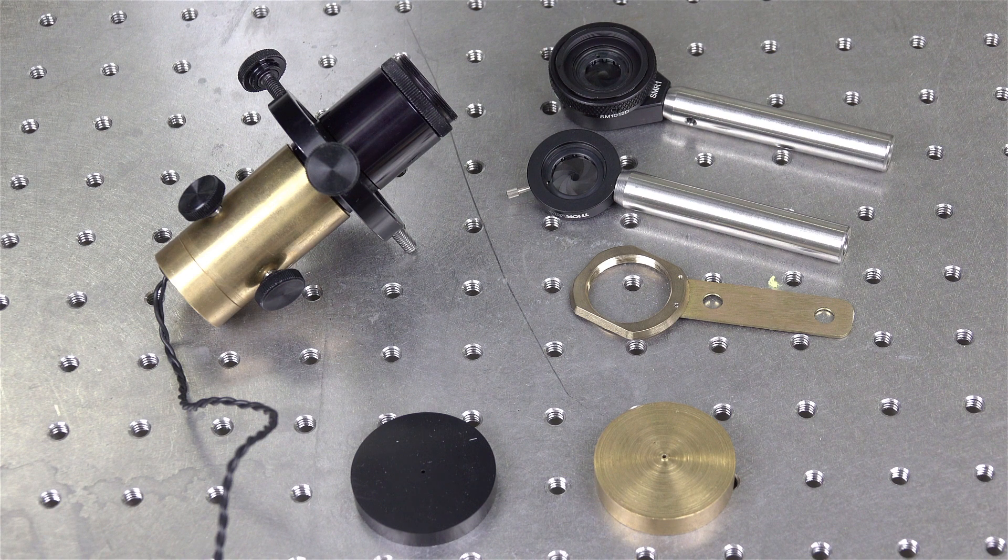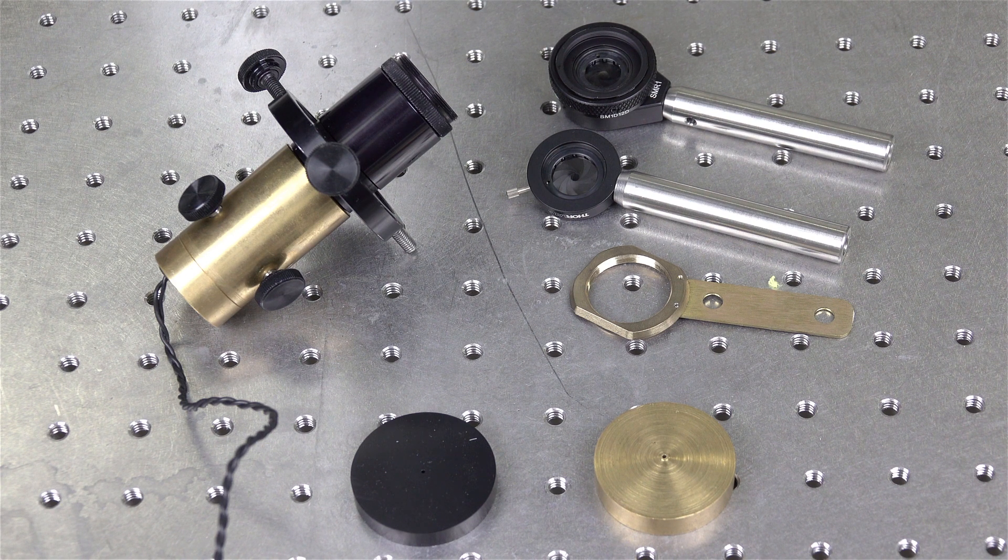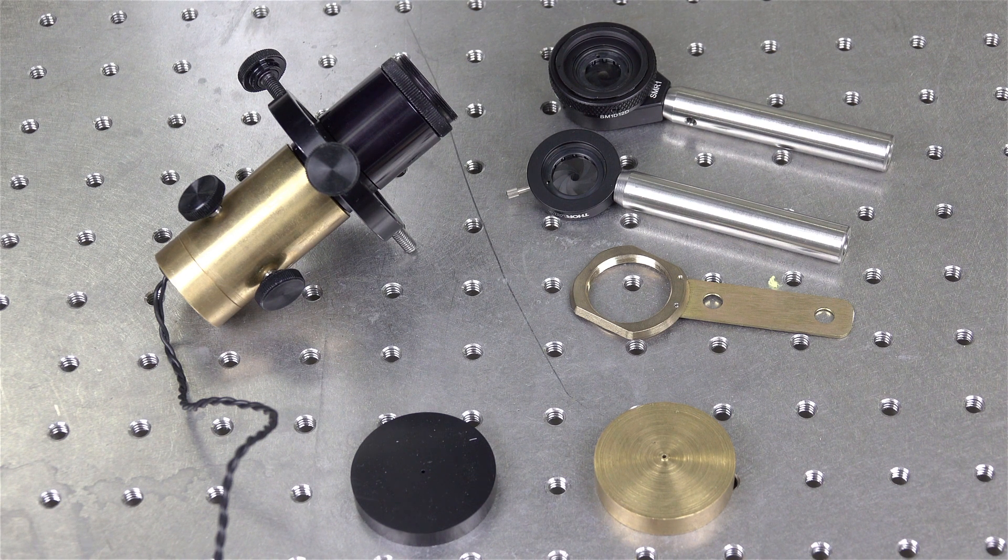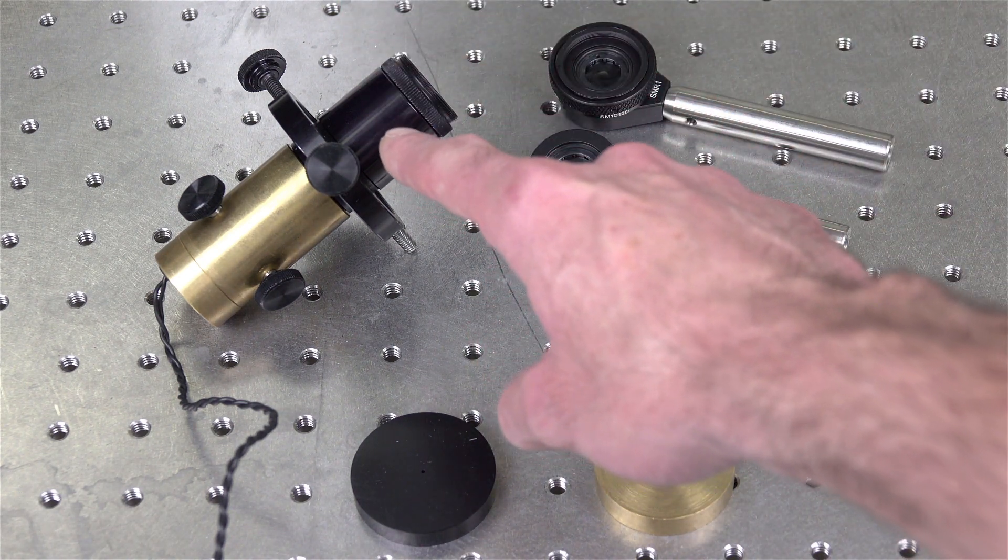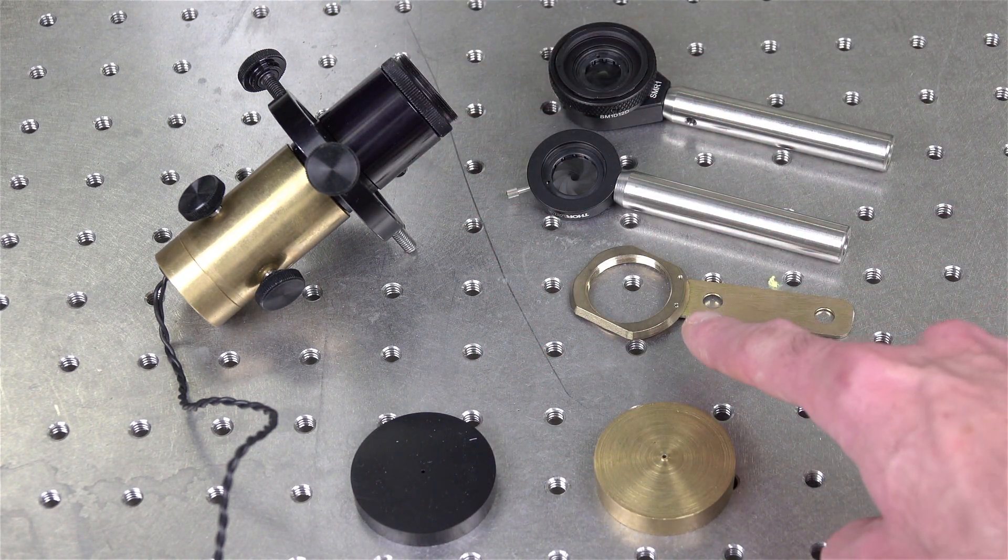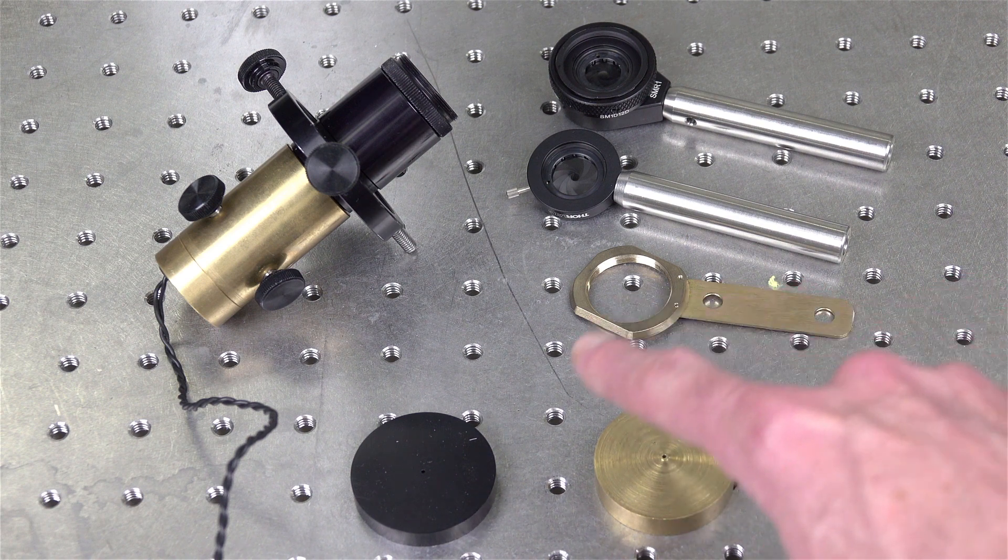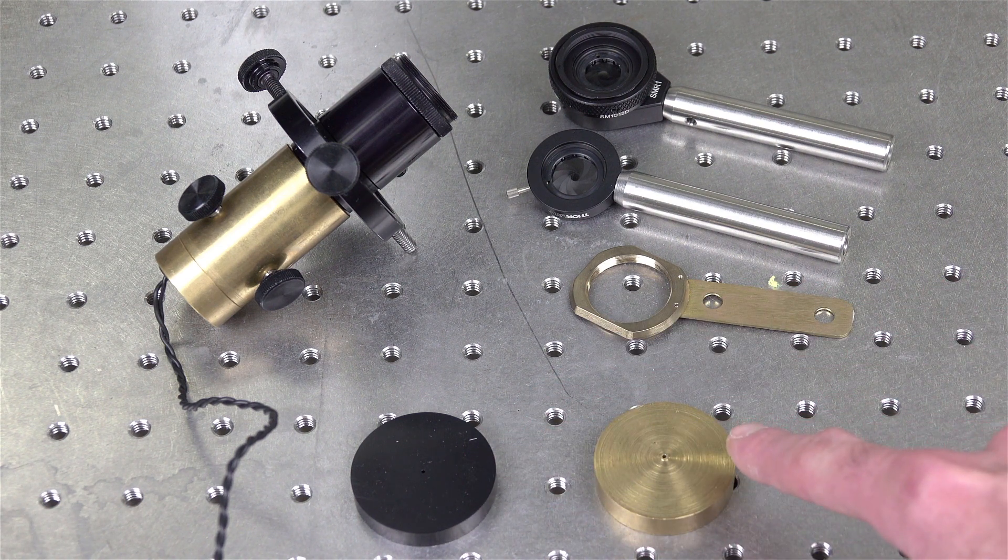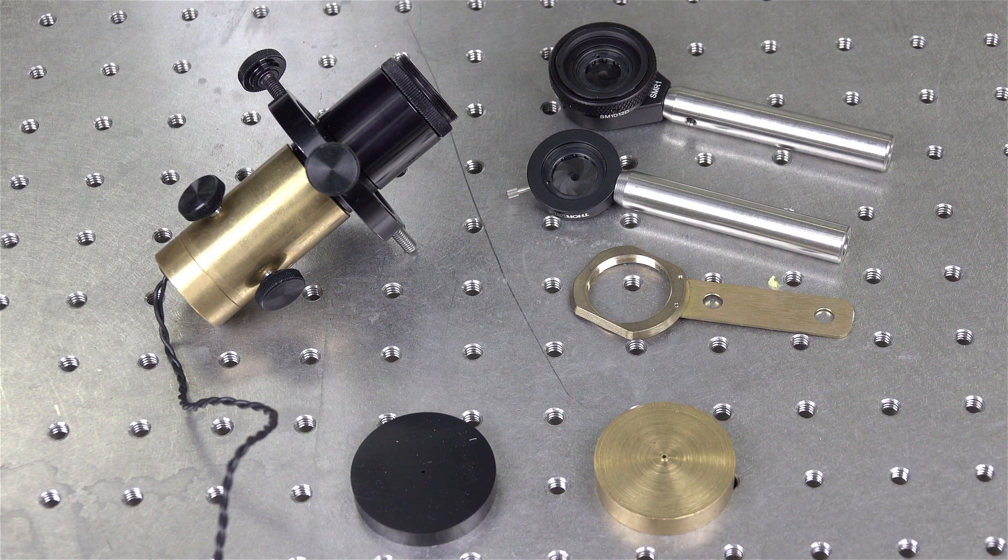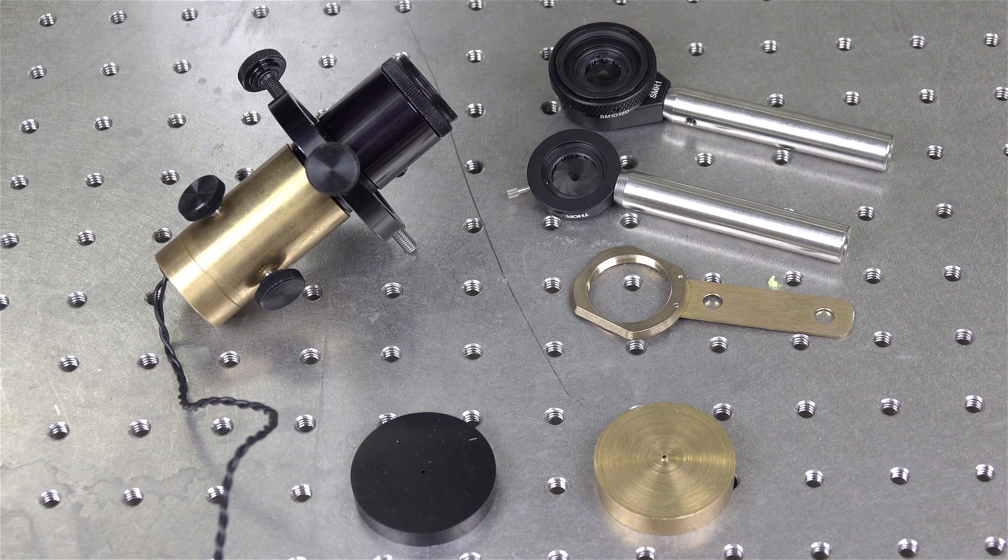For our Sutter movable objective microscope, we sell an alignment kit to assist you in aligning your microscope. This kit consists of an alignment laser that fits into the objective holder of the MOM, as well as a pinhole for the tube lens and a pinhole for the scan lens that will enable us to center the alignment beam through the microscope.